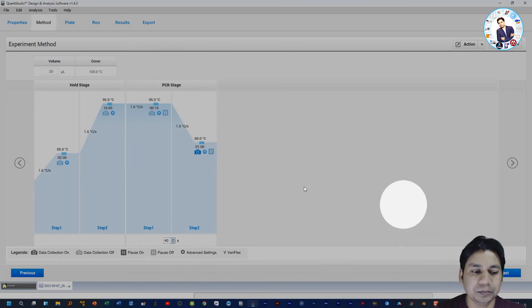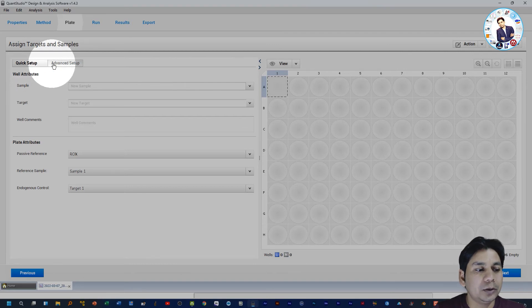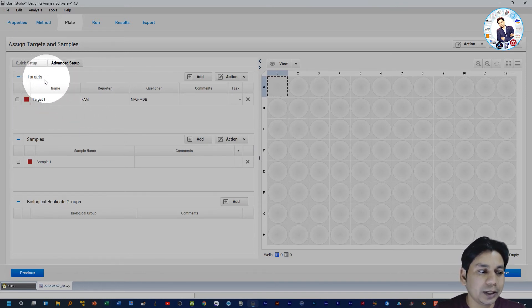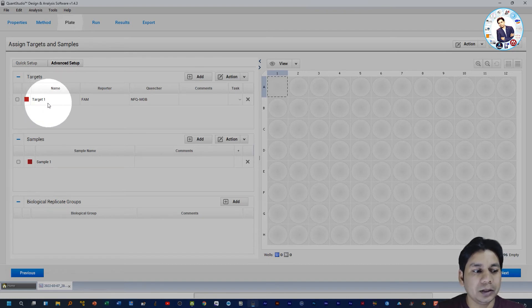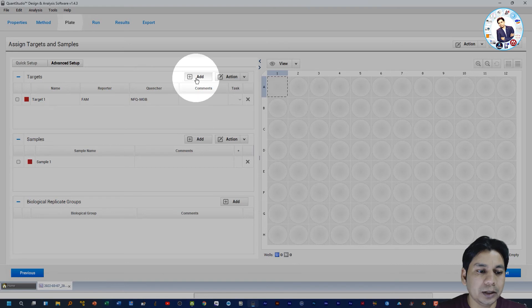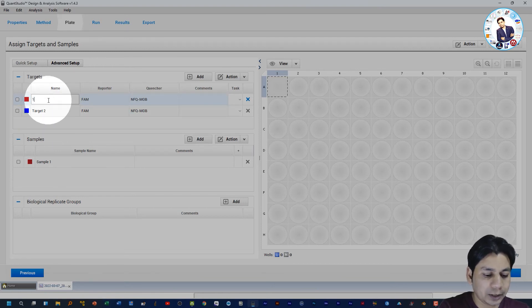In the PCR Stage you can set how many cycles you want to run — by default it is 40, but you can change it. Then click Next to go to the Plate Setup. Here you assign targets and samples. There are two methods: Quick Setup and Advanced Setup. I suggest using Advanced Setup as it provides more options. By default, Target 1 is present with reporter dye FAM and quencher NFQ-MGB. Click Add to add more targets.